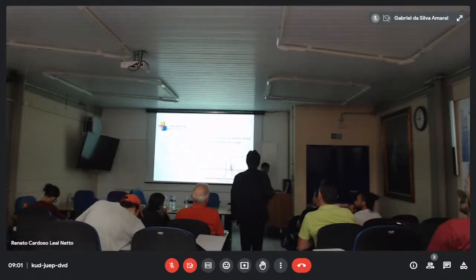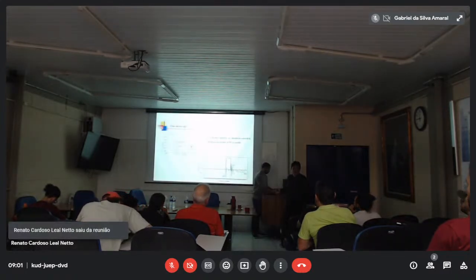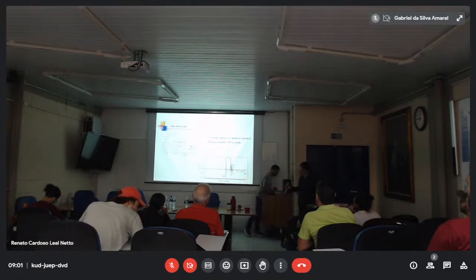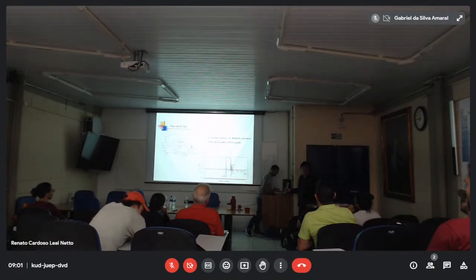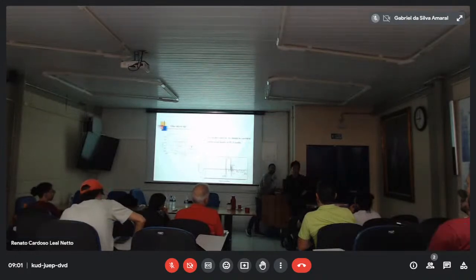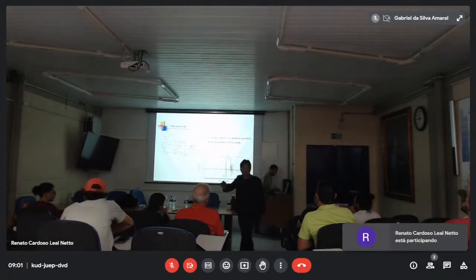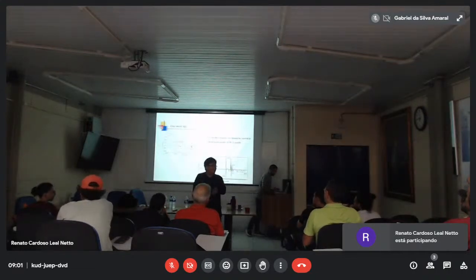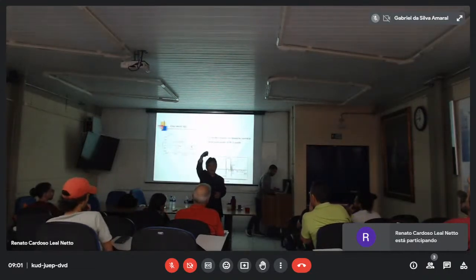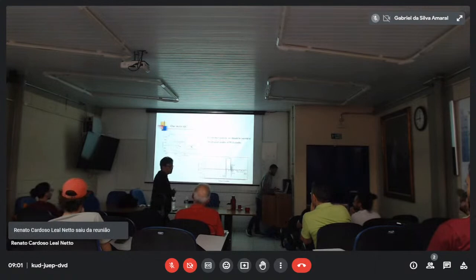Third one, I'll check it. Like this one here. It's not my data, it's from outside. Now, this one is glucose. And the other one is glucose, probably one spectrum, where he forgot to calibrate. So in the spectrum, glucose should be detected at 5.2 ppm, calibrated to 0 of TSP. But among the 100 samples, maybe he forgot calibration for one of the samples. Then this one is included, something like this.